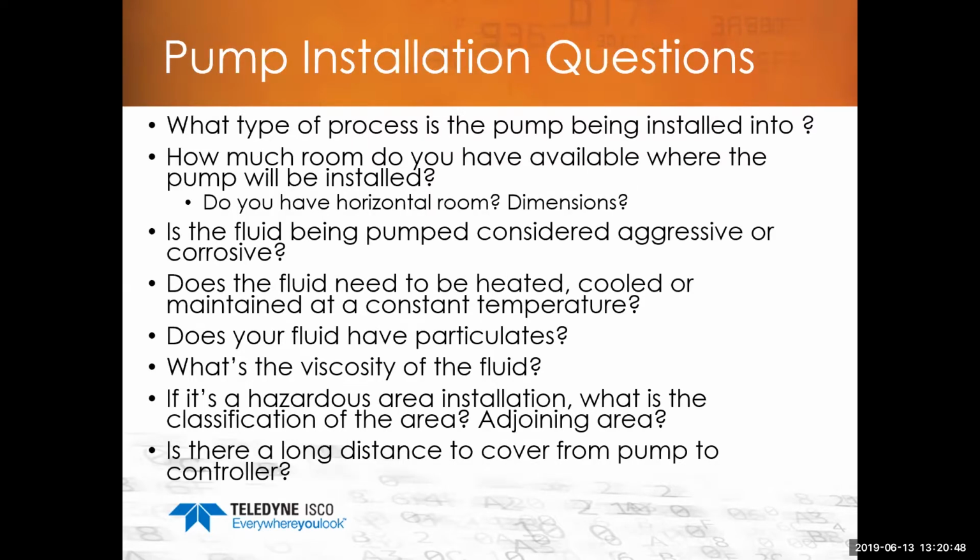Other types of installation questions that you want to think about as you're designing this, and you want to have this conversation with the vendors you choose. How much room do you have? Do you have limited space in the fume hood because you're adding a big reactor, or you have to have a scale, you have to have a few different valving options? Is the material being moved aggressive or corrosive? That's a very key point. That's a safety issue you need to make sure you stay on top of.